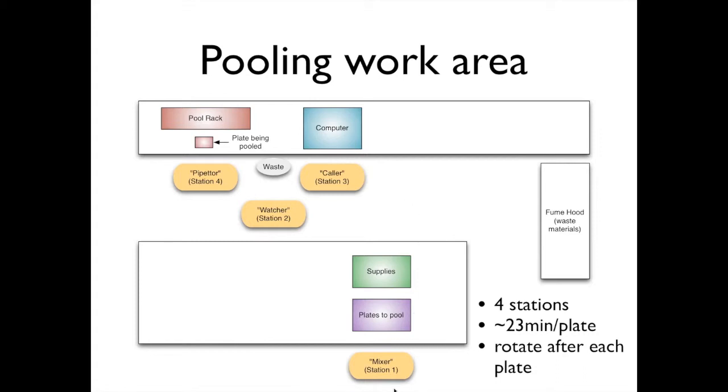What we came up with was a mixer. We have a person who is called the mixer. We work with 96 deep well plates to inoculate and grow cultures on a high RPM shaker with good aeration. After they're grown and they sit on a bench, the pellets settle to the bottom. So the person at the mixer station, just before a plate advances onto pooling, goes through with a multi-channel pipette and remixes the tubes.